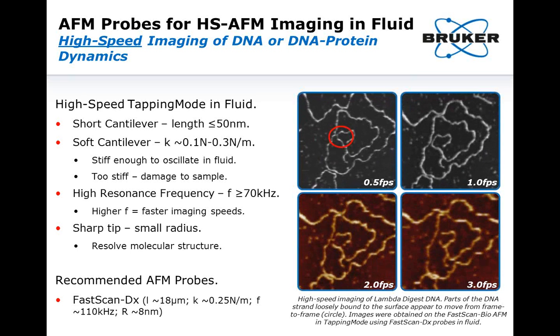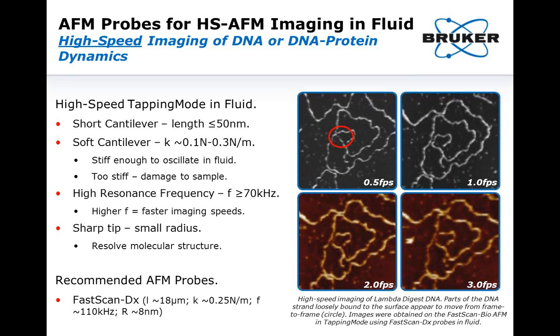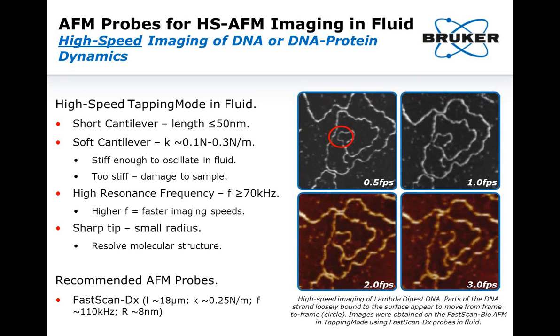As this image is acquired in tapping mode, we also need to have a probe that is stiff enough to be able to oscillate in fluid, but is not so stiff as to damage the sample. In this case here, the probe used was the Fast Scan DX probe.